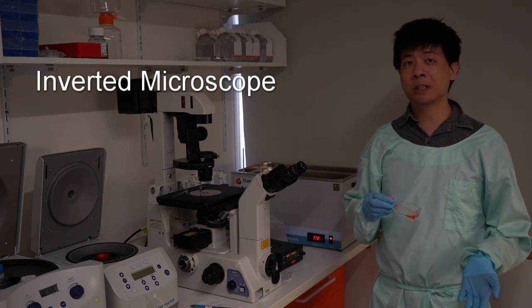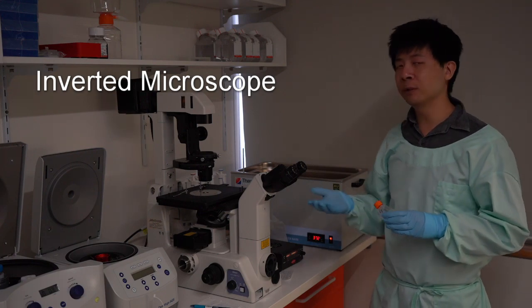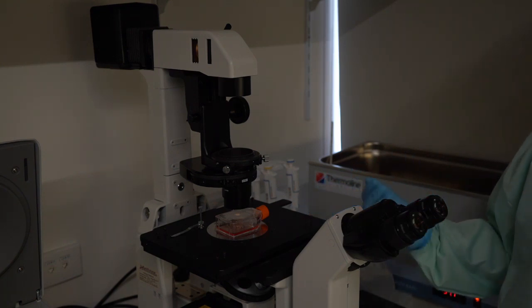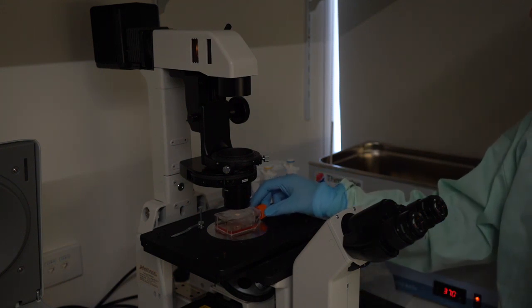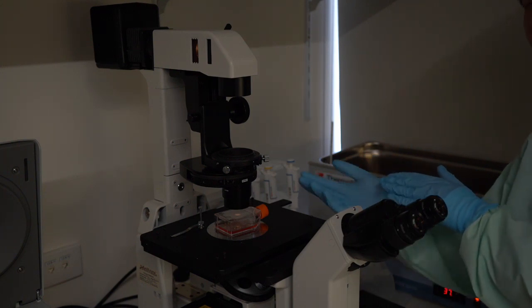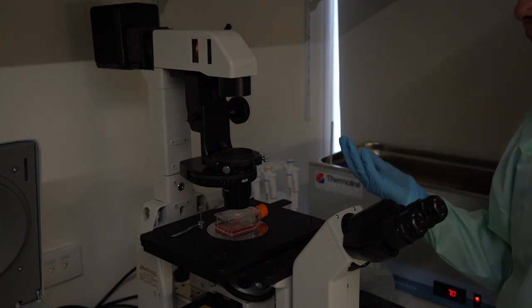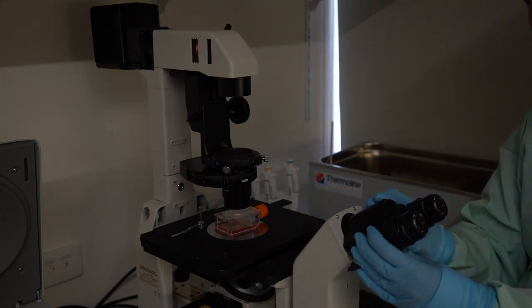Before starting any cellular experiments, it is important to check the health of the cells. For this, we use a standard light microscope. This is an inverted light microscope, which allows us to place a sample with the objective at the bottom, allowing us to view adhering cells at the basal surface of the flask. This works by channeling light produced by a halogen lamp, illuminated through the sample and through the objective, which you can view through a binocular.